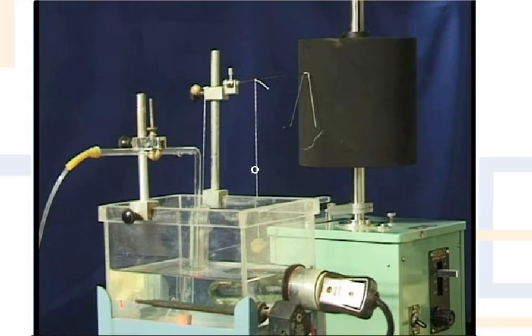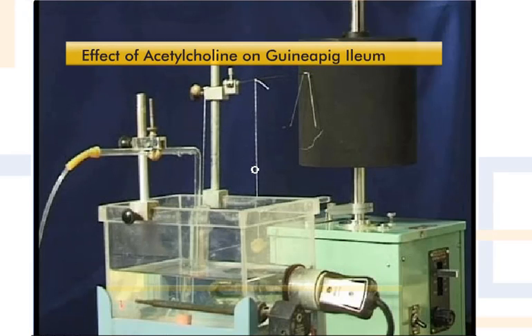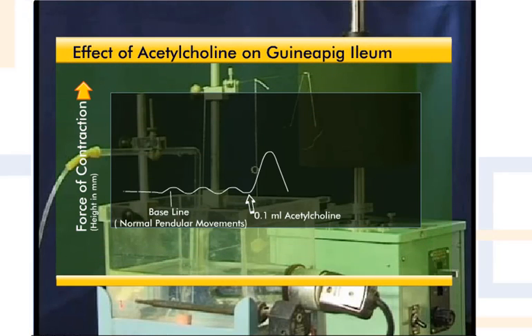You will observe upward movement of the tip of the frontal writing lever on the smoked paper. Stop the drum and rapidly wash the preparation with fresh Tyrode's solution. Allow relaxation of the contracted ileum for about 4 to 4.5 minutes.